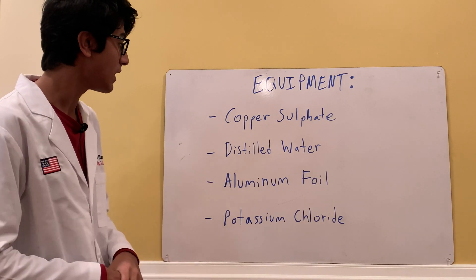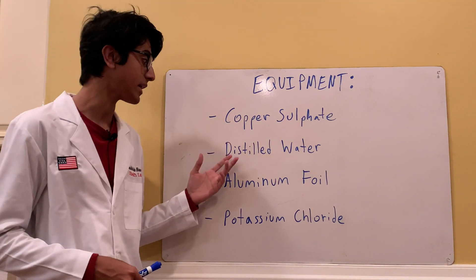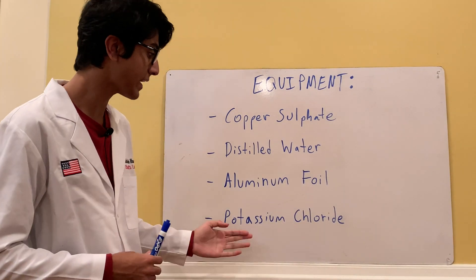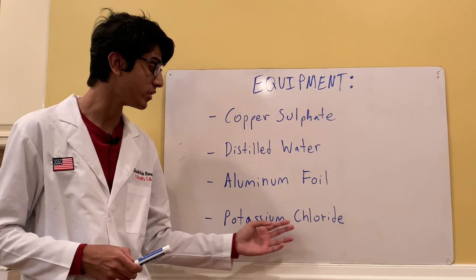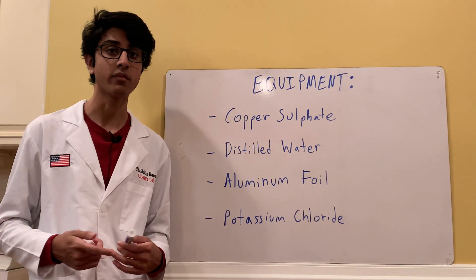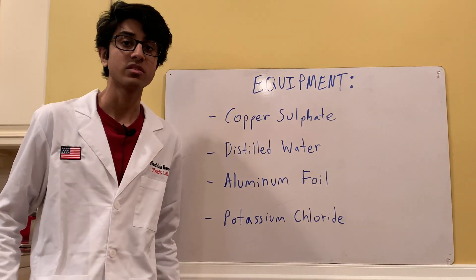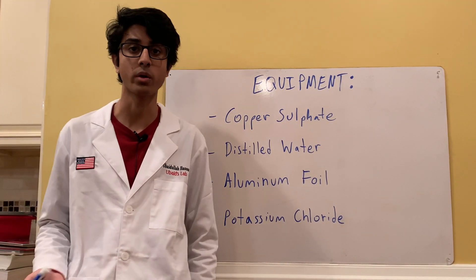Next we need distilled water — that's what we're dissolving the copper sulfate into to make an aqueous solution. And then we need aluminum foil, which will act as our aluminum metal reactant. And potassium chloride — potassium chloride acts as sort of a catalyst because the extra chloride ions speed up the reaction. I'm using potassium chloride because I have a lot lying around from previous experiments, but you can use NaCl, which is sodium chloride, just normal table salt.